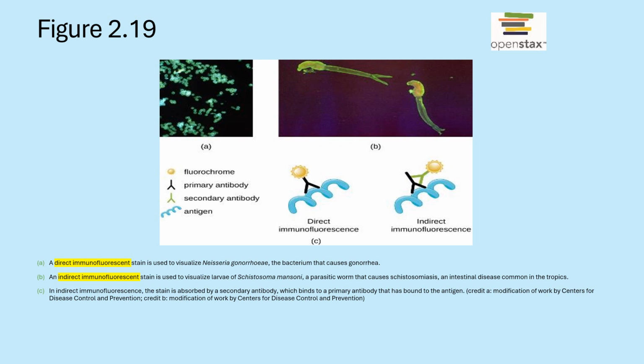There are different reasons why you may or may not want to do either process. When you look at it under the microscope, it's a fluorescent dye, so it will glow. It makes it a lot easier to very quickly see, and sometimes you may need to enumerate or count how many things you have there.